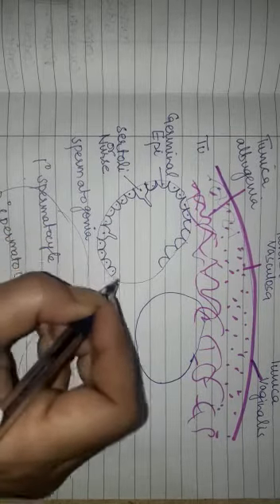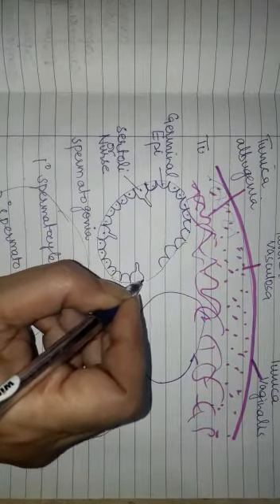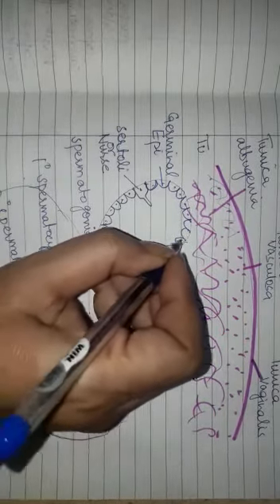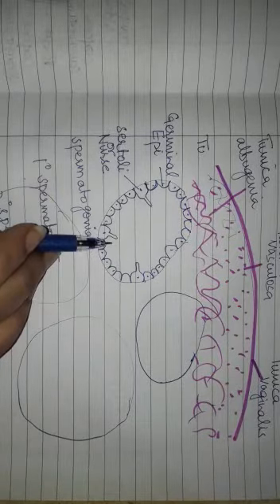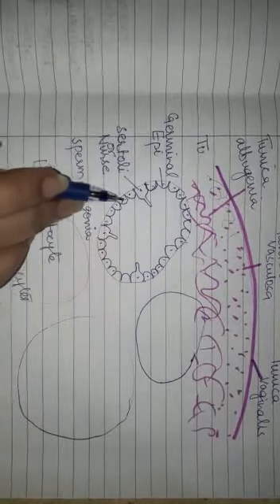Germinal epithelium, the cells are small, cuboid. This is the layer of germinal epithelium. हम ये क्या बना रहे हैं? This is one lobule of testis. It is lined by germinal epithelium. Majority of the cells are cuboidal.